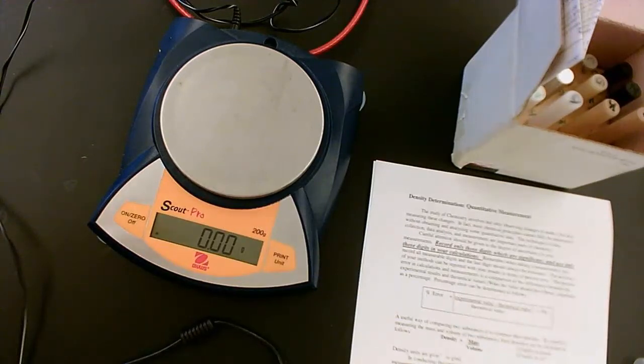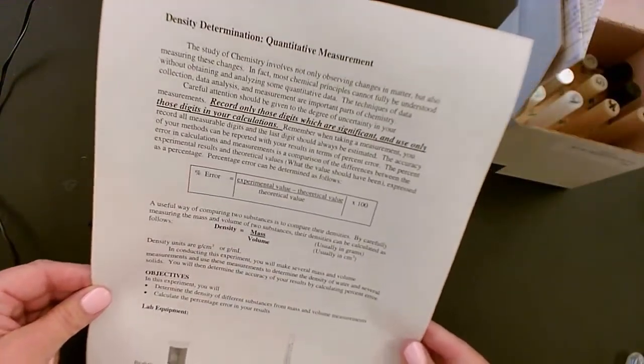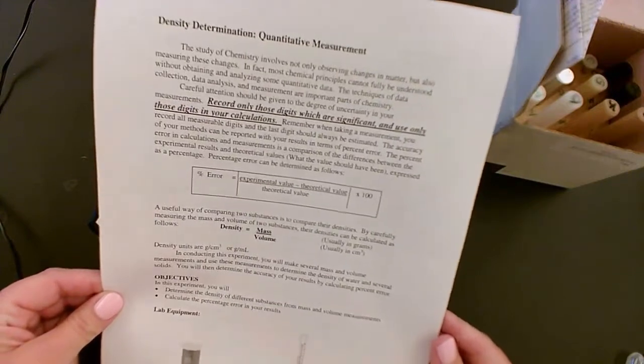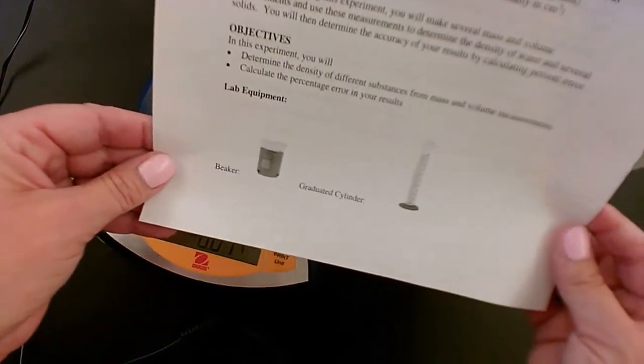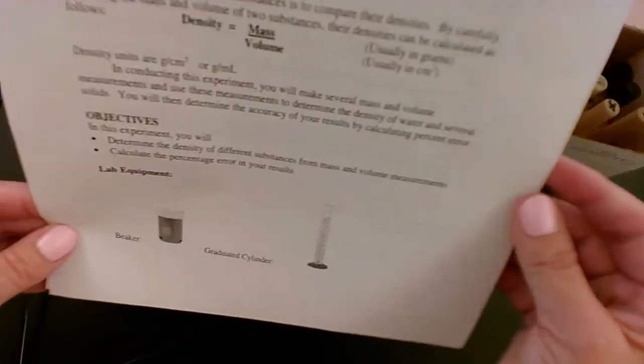Okay guys, today we're going to do the density determination lab. It's on Schoology. If you haven't found it, it looks like this. It has the equations on it, and in case you don't know what a beaker or a graduated cylinder is, I also show you pictures of those.